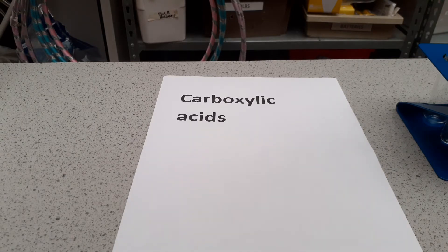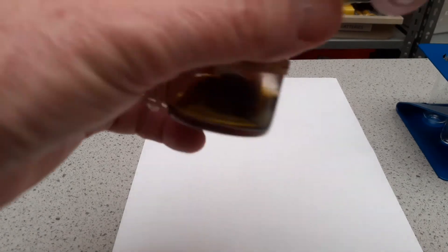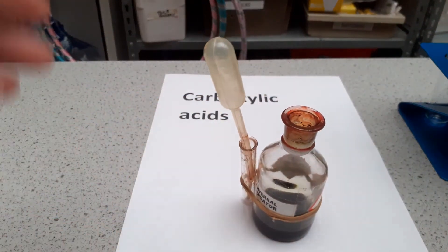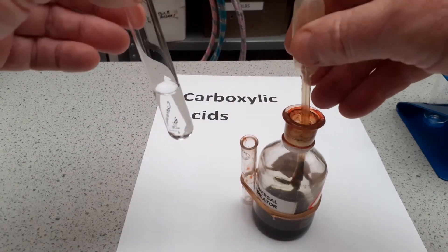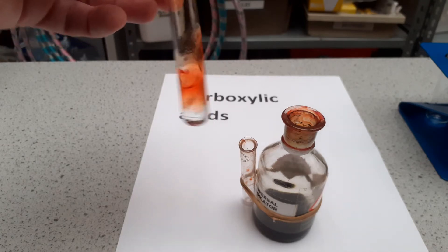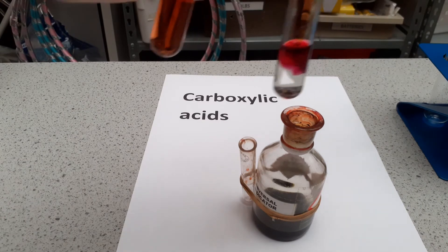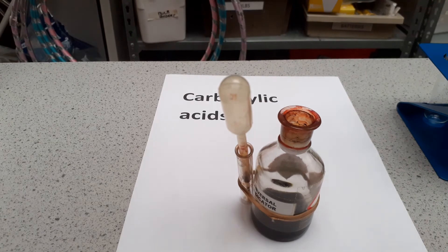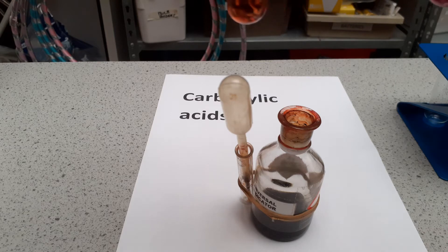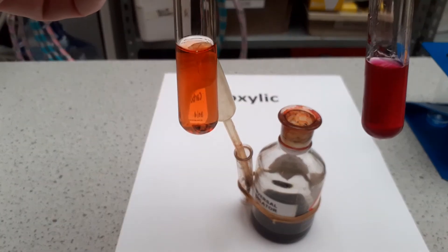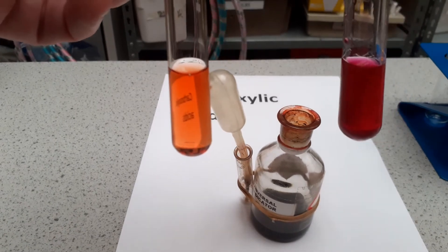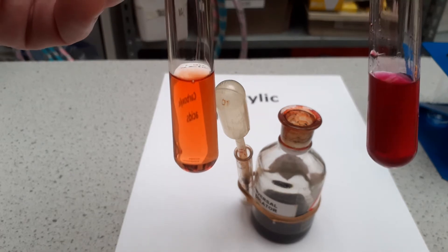Our first test is with universal indicator. I'm going to add a small amount of universal indicator to each of them. This is the ethanoic acid — we look at the colour there — and I'm going to do the same with hydrochloric acid. You can see the hydrochloric acid is much redder. The ethanoic acid has a pH of about three, while the hydrochloric acid with its dark red colour has a pH of one. So we can say that hydrochloric acid is a much stronger acid than ethanoic acid.